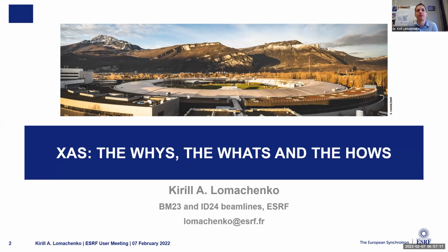Okay, there is a question from Huan Yu. Long question. Taking a lithium-ion organic solid state battery during the charging process, for example, lithium ion flows from lithium metal through the solid state electrolyte to the reduced cathode material. Does the mobile lithium ion make any influence on the EXAFS signal of other atoms of the electrolyte? Is it possible we observe any difference between with and without lithium ion flow? Some theory about lithium ion flowing in electrolyte claims the hopping of lithium ions between lattices. Will EXAFS prove the theory?